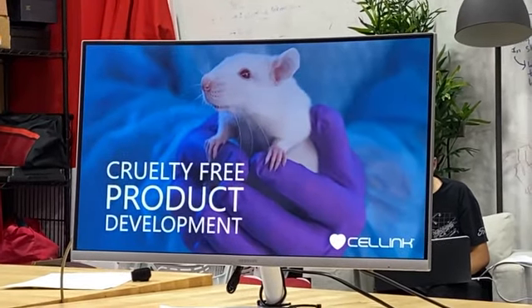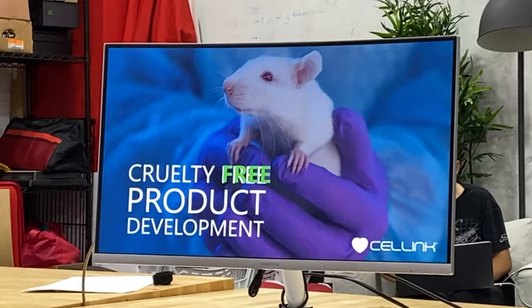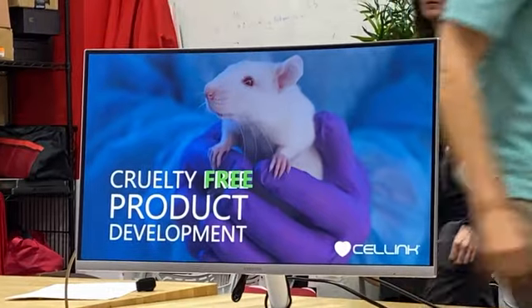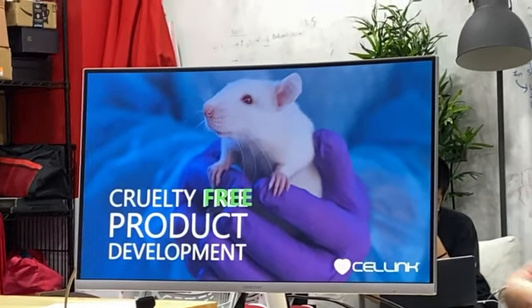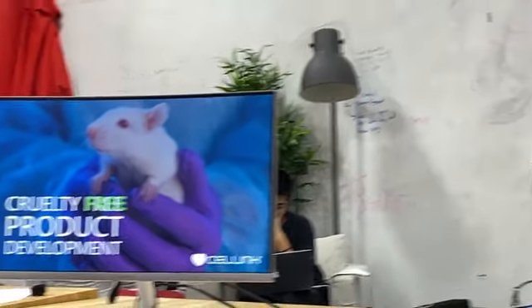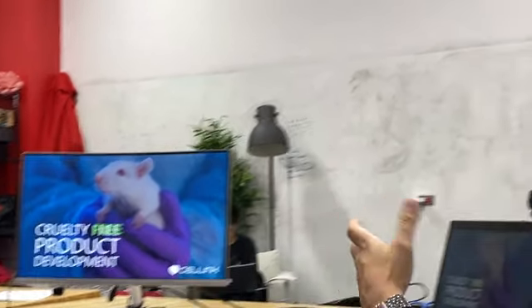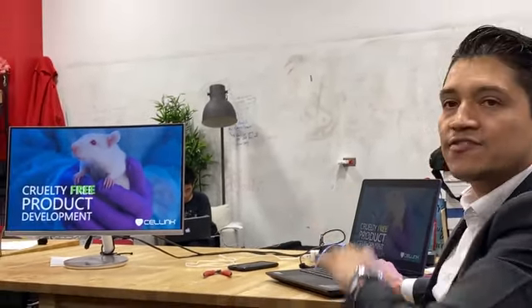And the second is that normally when you are doing research in the lab, you use animals like a pig, like a mouse, like monkeys, to test different drugs, yeah? And that is something that is going against the, I don't know how to say that, the ethics, exactly, yeah? But there is no other way to test that, right? So we would like to use this kind of technology to test drugs and all kinds of molecules and chemicals, just to avoid the use of this kind of experiments.